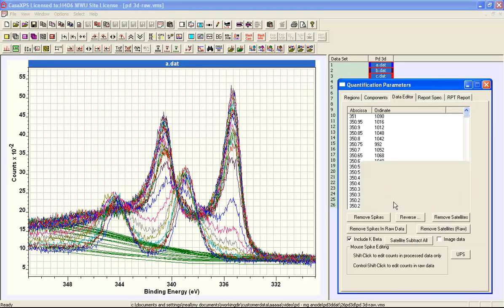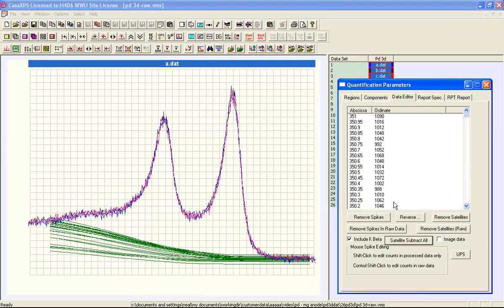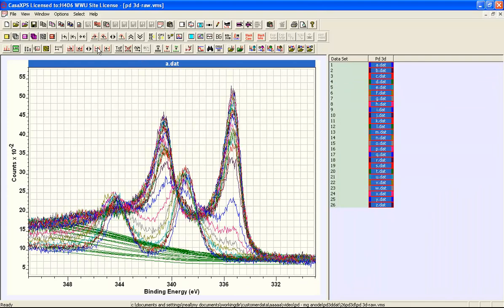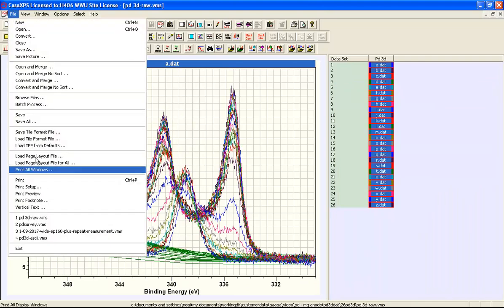And this time I'll say yes and since I've now processed the raw data I'm going to save these data to a new file name.